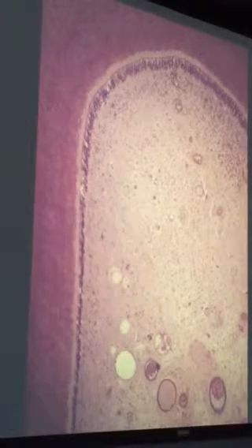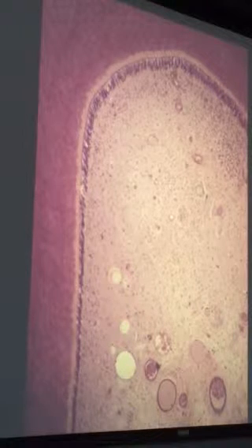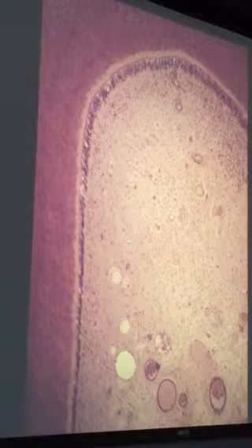Okay, so here we have, this organ would be what? Pulp organ. And right here we have a ring of cells, those are what? Odontoblasts, and what is this area right there? Cell-free zone of Weil, and then we have cell-rich zone. And we have a structure right there.